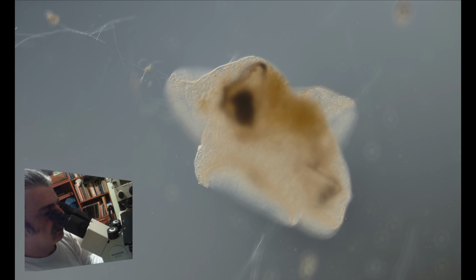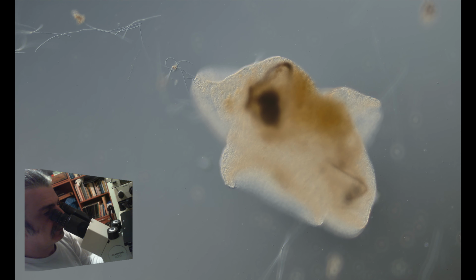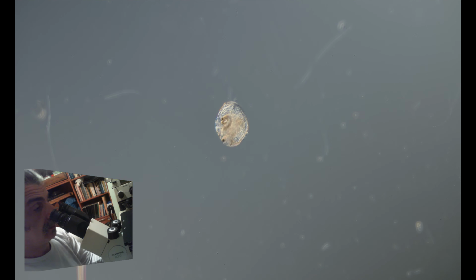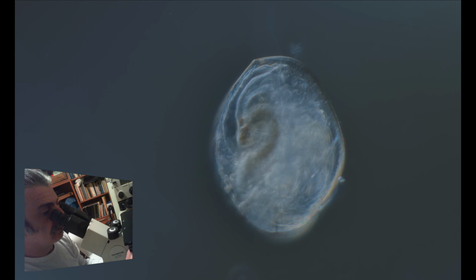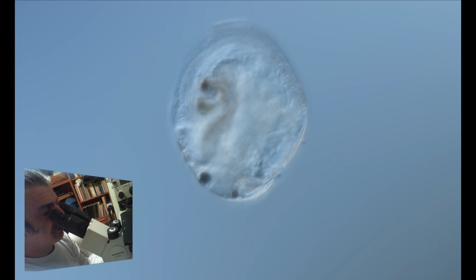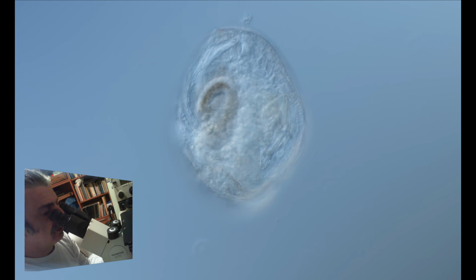This one I suspect was a snail. And here is a water flea. So neat. Water fleas are actually small crustaceans.